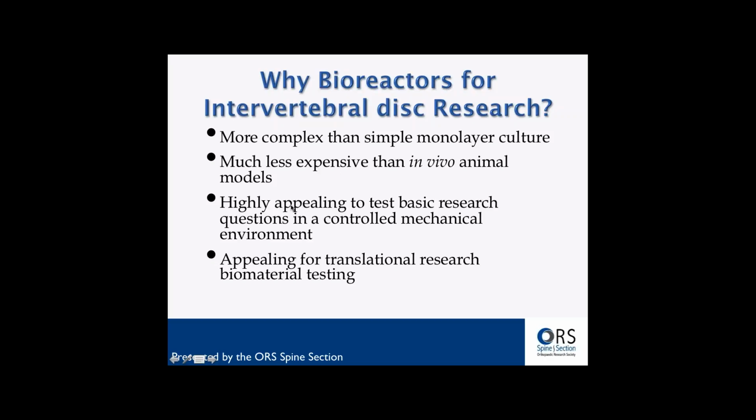And these organ bioreactors are highly appealing because you can control the mechanics and you can control the culture media, for instance, as Fackson Mwale pointed out. And at the end, as I already pointed out, you can test translational research. So you can test biomaterials together with cells and whether they're doing any good.